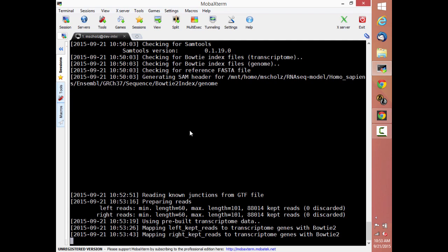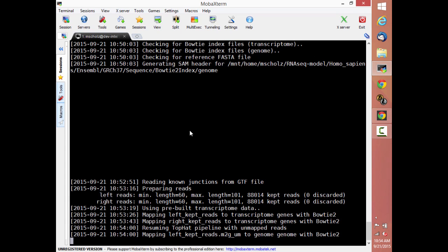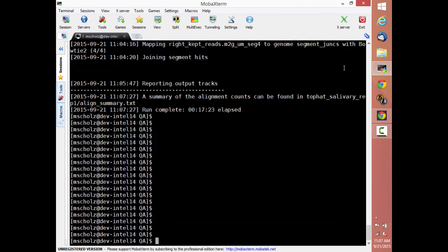When you do an alignment to a bacteria, you don't need any of that. All you need to do is just align to the reference genome, and then the tool downstream is going to use the GTF file to give you the names of the genes and the locations.